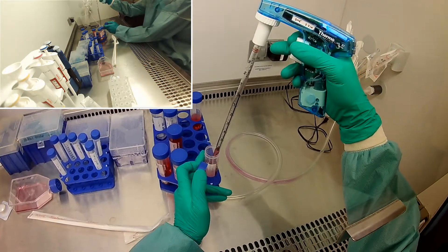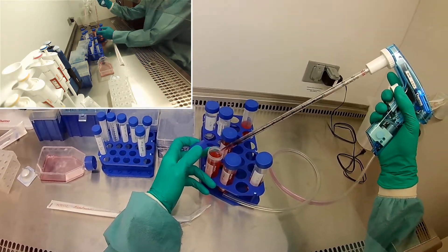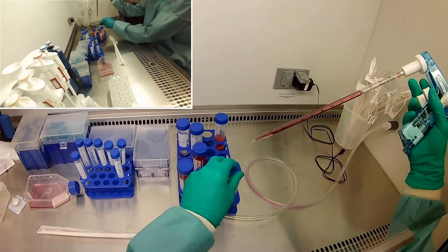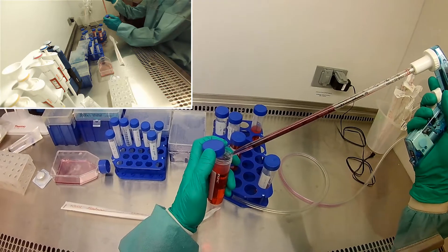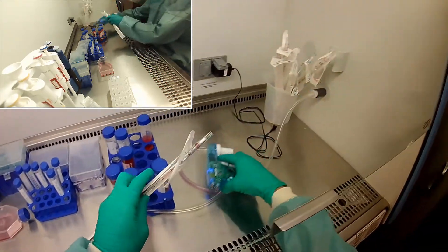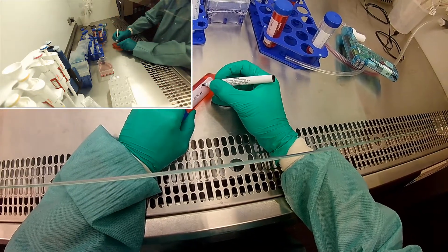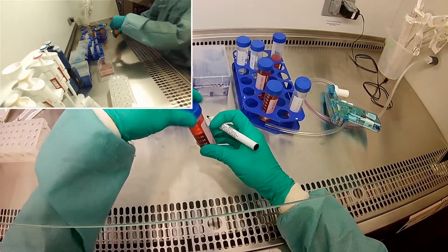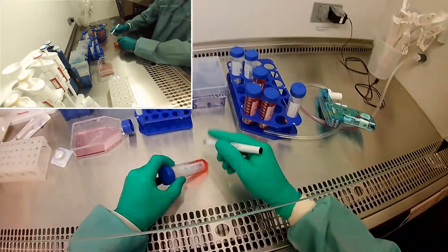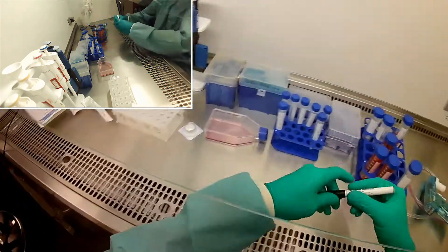We need low serum for this because serum really promotes cell division and growth. When we're plating on this 96-well plate for cytotoxicity, we just want them to survive — we don't necessarily need them to grow and reproduce because we're putting a lot of cells in anyway. We just want them to attach, and then we're going to feed them their chemicals and see if they survive. So now I need to make sure I relabel this — it's no longer DMEM only, it's 2% BCS. Same for the second one — no longer DMEM only, 2% BCS.